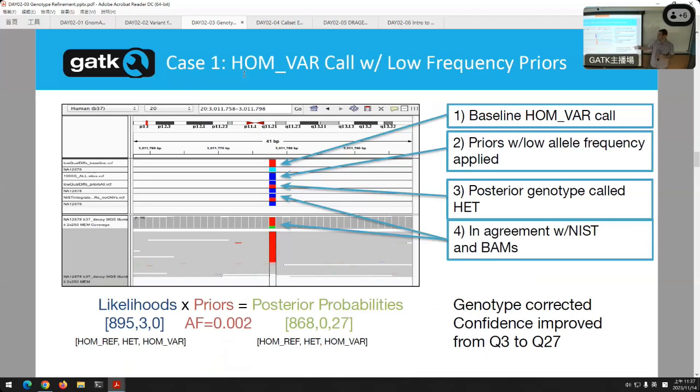It's probably not somatic, because if it's a somatic mutation, it means you have the mutation and then you turn it back to normal, right? So probably not a somatic mutation in this case.